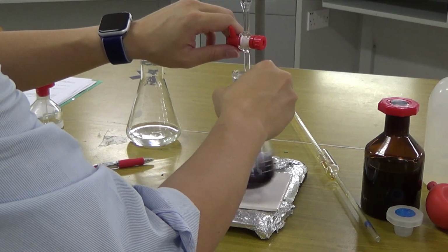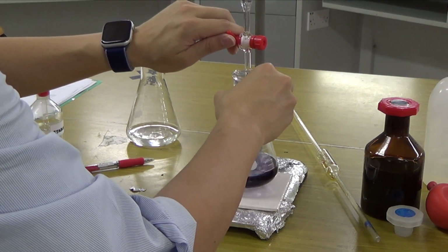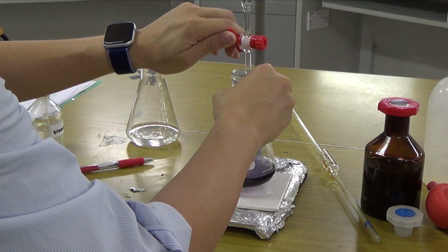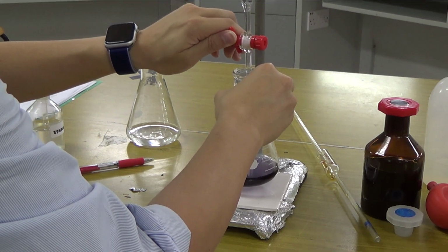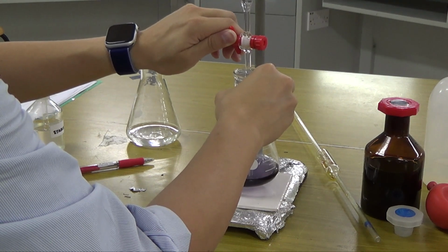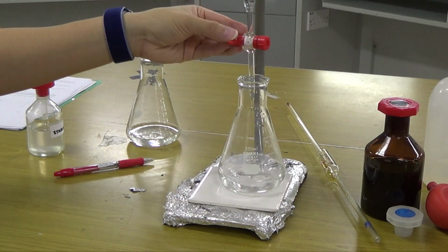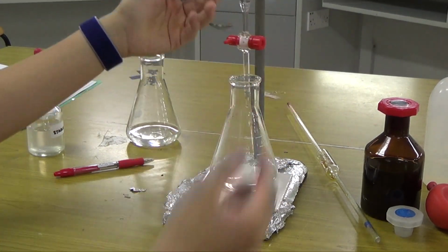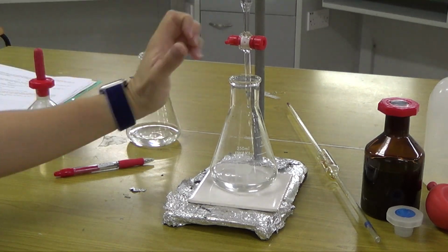So you need to be very patient at this stage. So just keep on going. So very close now. I think one more drop will do. Just be careful. I shouldn't have stopped. There you go. One drop and it went colorless. Just one extra drop and it went colorless. I shouldn't have stopped just now. I should have let it go all the way drop by drop until it changes, and only then stop.